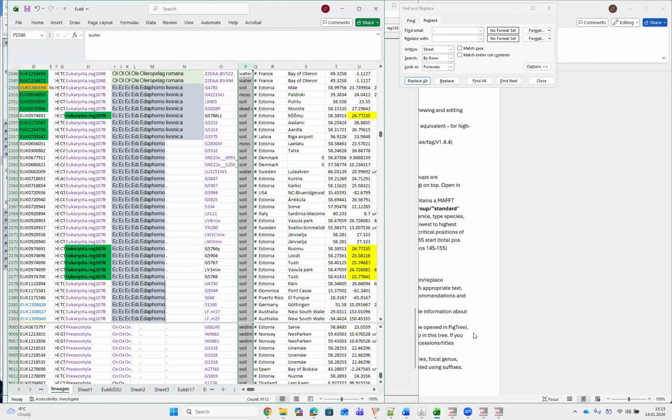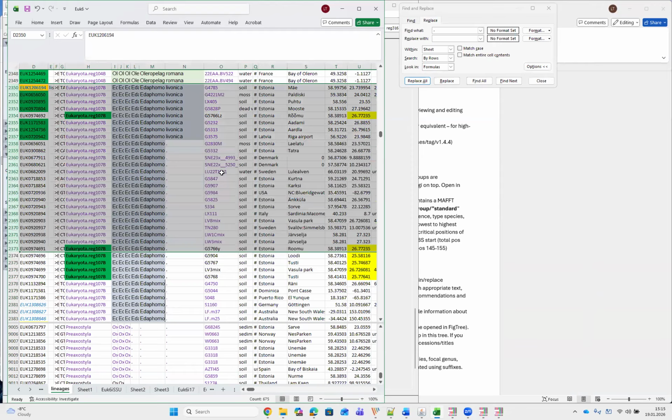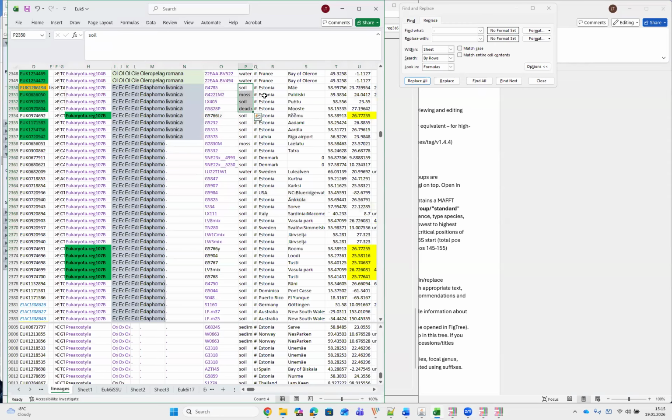The metadata template looks like this. It's sorted by group. First is the type species and type sequence, and substrate, country, locality, geographical coordinates, and hidden are also a few extra fields of information about the biome and dominant vegetation in the site, which is not important here.